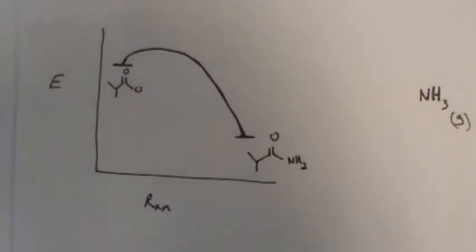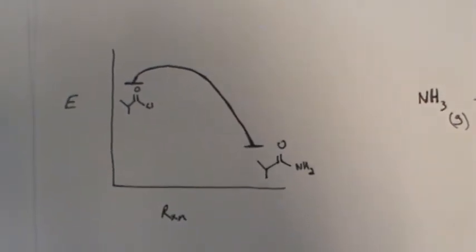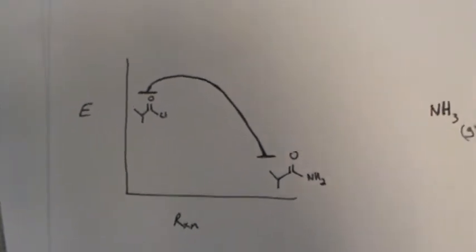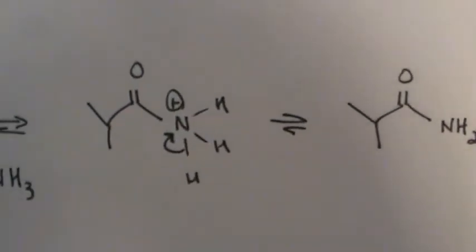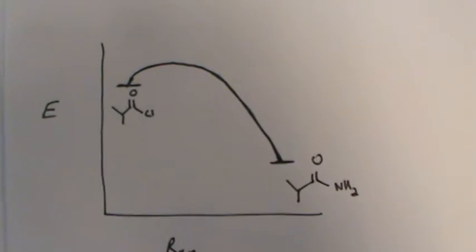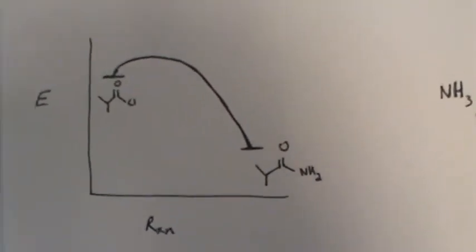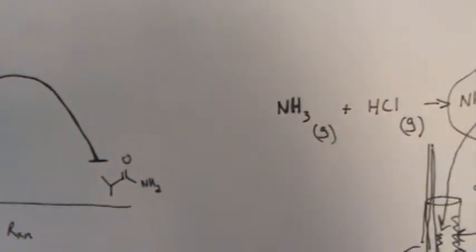And it turns out that it obviously was. You add a little bit of ammonia, you can even hear it popping when you add it, giving off a lot of heat. So it's obviously exothermic. Whether or not we can think of this as being an intermediate, I don't know for sure. I chose to just write it as a simple reaction energy diagram. Very exothermic, and the fact that you did observe some heat, so we know that for a fact.